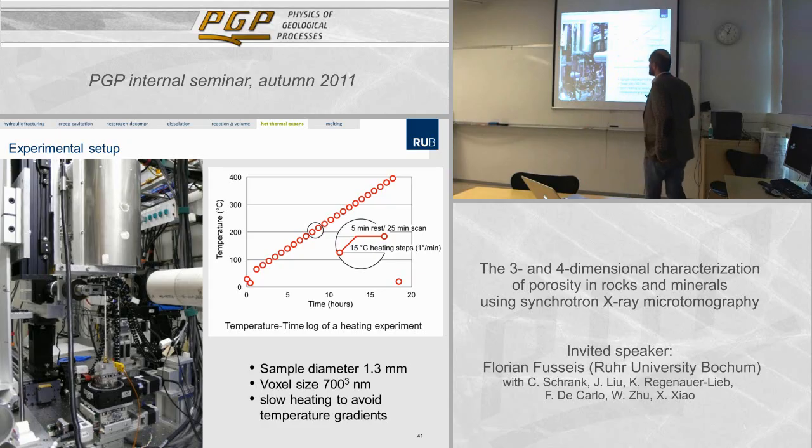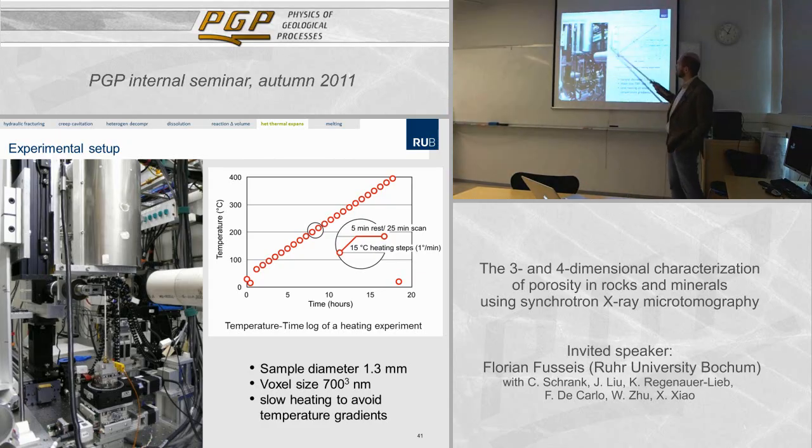We built a more sophisticated furnace for this experiment, and that was really challenging to do. Actually, this is the latest generation of that furnace. Sitting up here, it's then going to be lowered over the sample. The sample itself sits on this about 20 centimeter long ceramic pole. You can hardly see it. This is the whole detector array, and the blue bit out there is the high-speed imaging camera that we're now using.